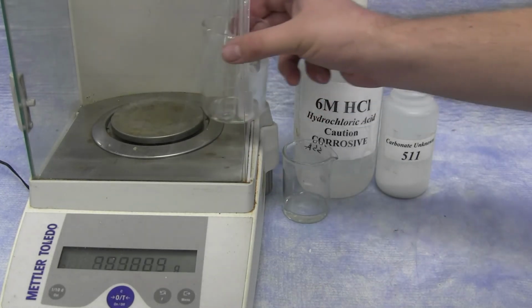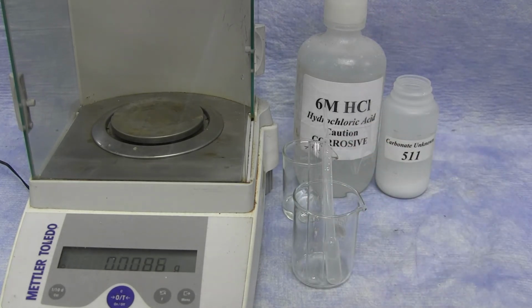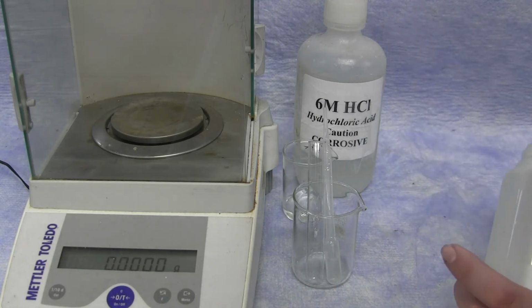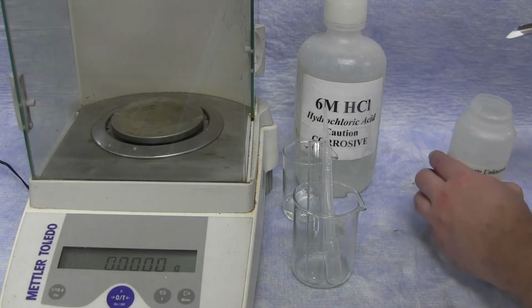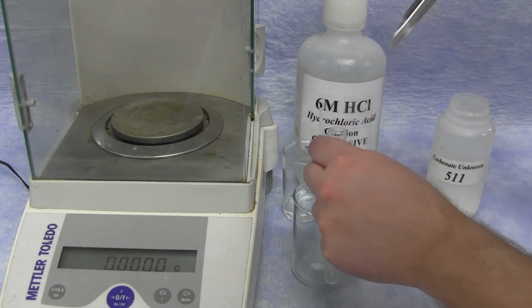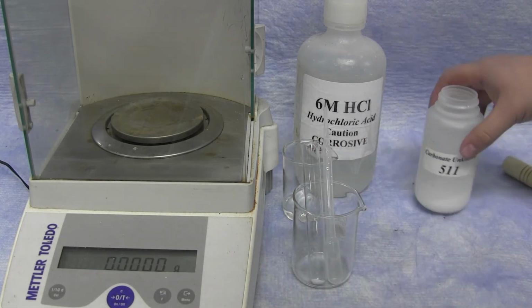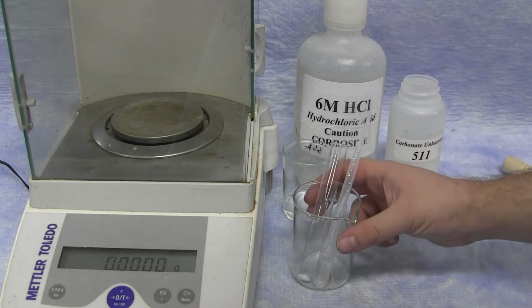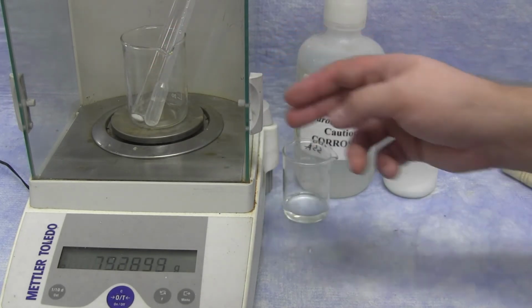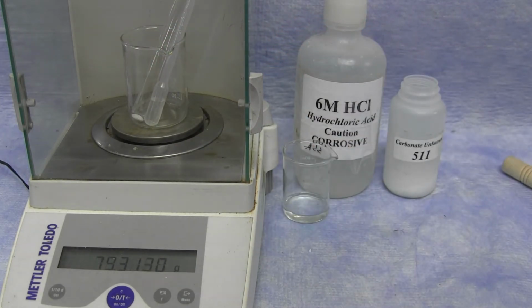You'll then add approximately half a gram of your carbonate sample that you're going to test. This is going to be very approximate, and it does not necessarily need to be half a gram exactly, but thereabouts. And then you can obtain the combined mass again.